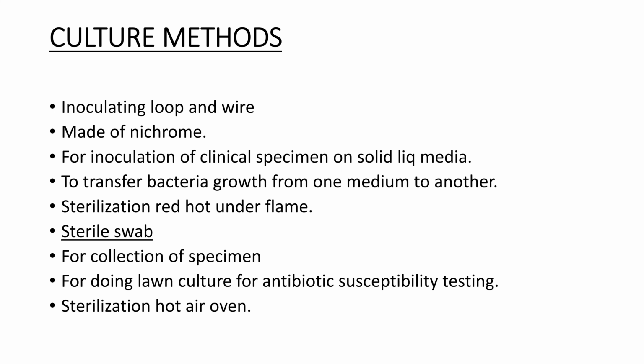So now the next is the sterile swab. It is used for the collection of specimens for doing lawn culture for antibiotic susceptibility testing, and its sterilization is done by hot air oven.